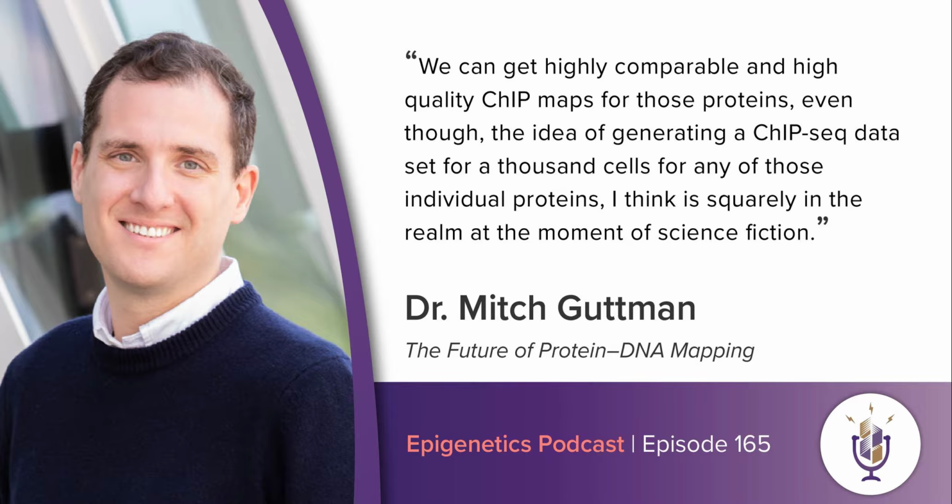And it's hard to say, we don't know the exact answer for why that is, but we think the reason is for two general reasons. The first is that the major limitation in the number of cells that you need for a ChIP experiment is really about the amount of DNA you're pulling down. So, for example, if I took 1,000 cells and tried to do a ChIP experiment on 1,000 cells, you have some background DNA that sticks to your tubes, to your pipettes, to your beads, and then you have signal.